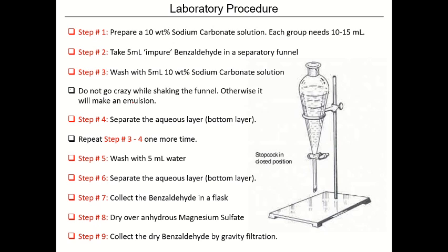Wash with 5 milliliters of water. Separate the aqueous layer. Then collect the benzaldehyde in a flask. Dry over anhydrous magnesium sulfate and collect the dry benzaldehyde by gravity filtration. So that's the way to do it.